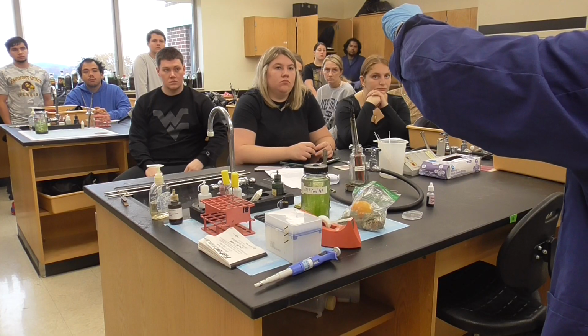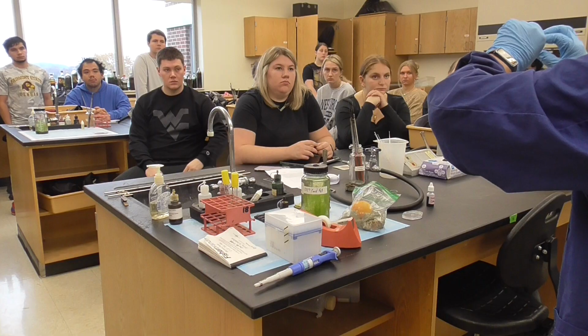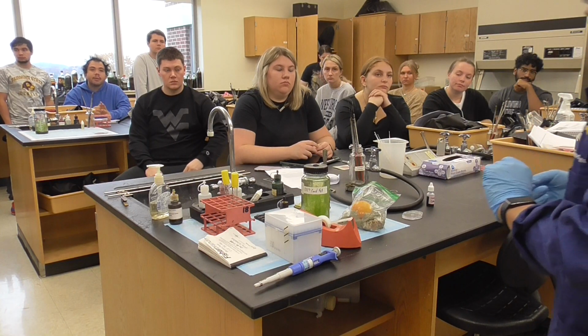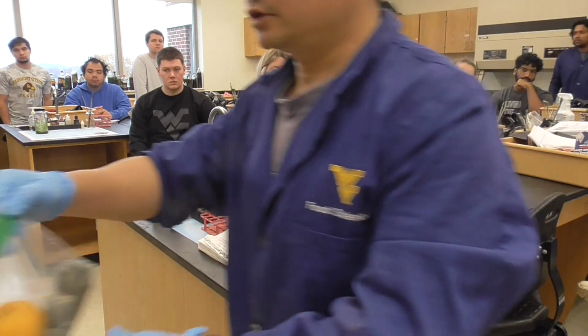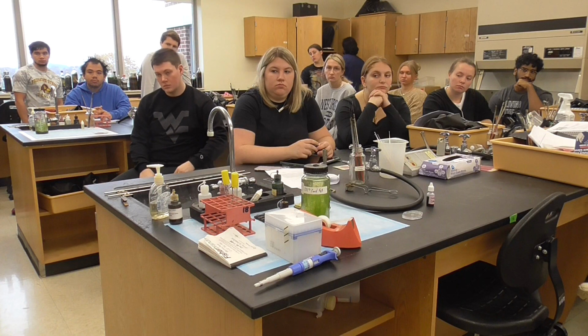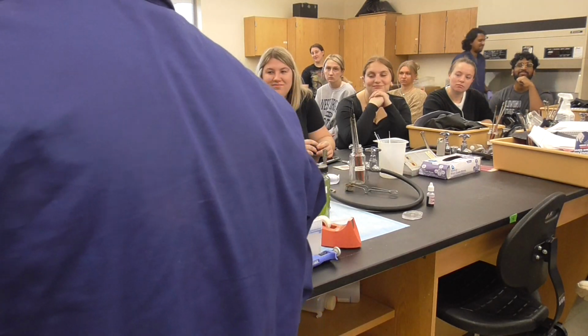Well, it depends on your technique. Okay. Then cover it and observe underneath 40x. This I will put here. You guys take turns to do it. Okay, you can put this orange one out. I don't need this orange one, to be honest. Very bad. So only go there.